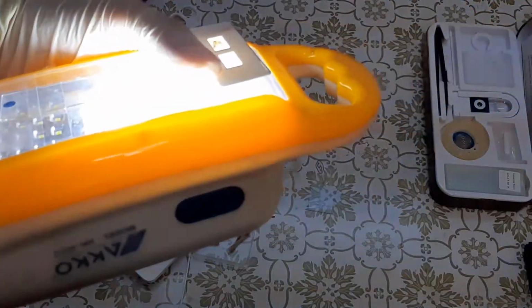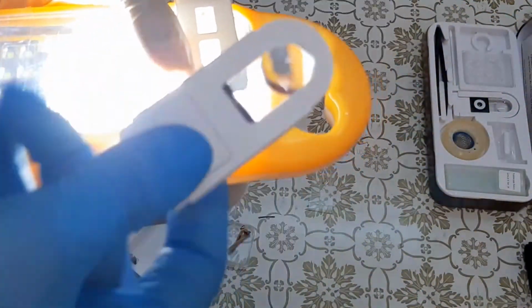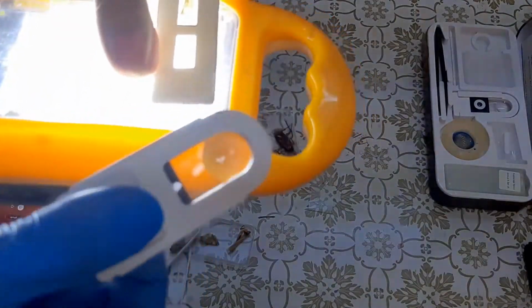So as you see, with the Foldscope, sometimes we can't get the bigger picture for the samples. So I use these kinds of lights along with the LED magnifier to zoom in and see the bigger picture for the samples that I use. As you see here.